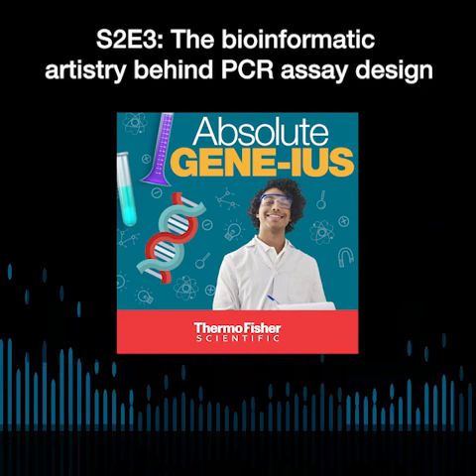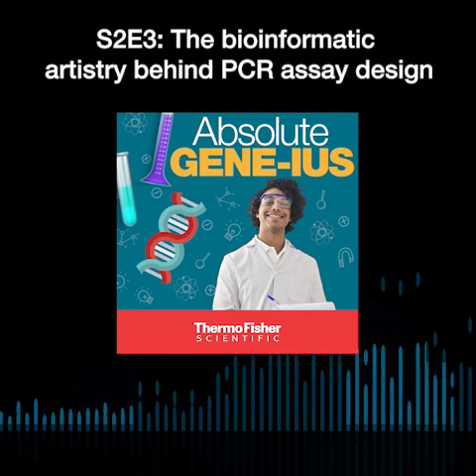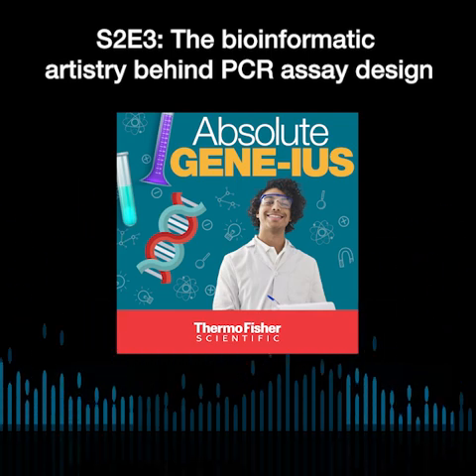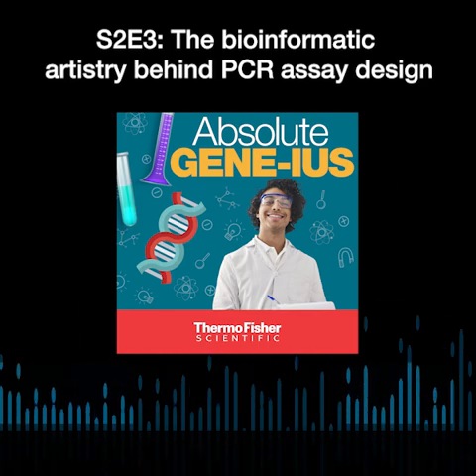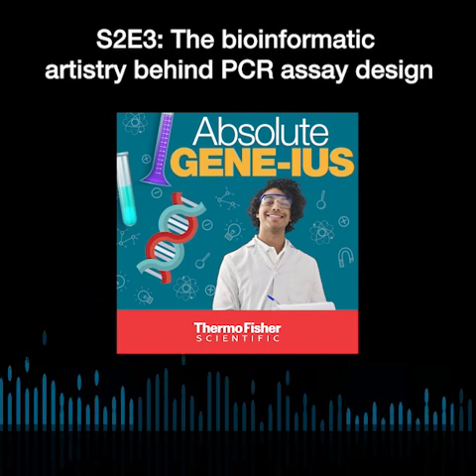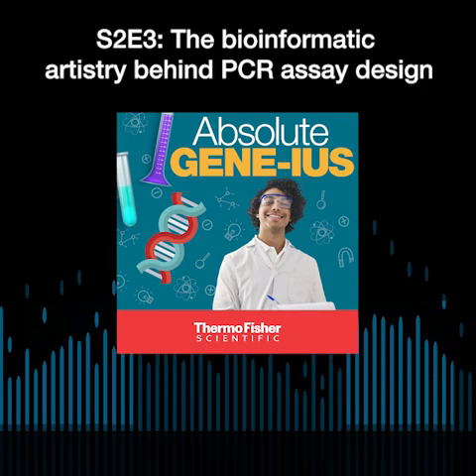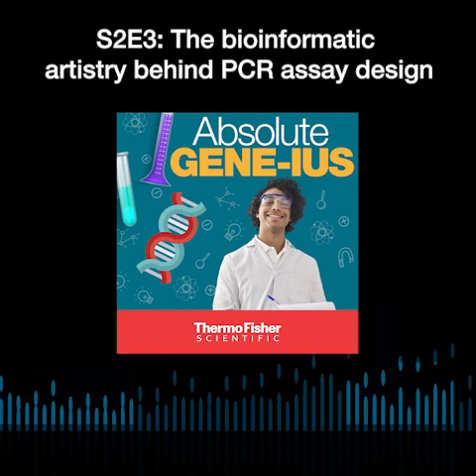I use CYP2D6. I'm actually going to also say CYP2D6. Mine's a slightly more sentimental reason, though. The very first assay I ever designed, that Rounak was teaching me how to design assays, was for CYP2D6. There you go. That's awesome. It goes to the point where I say that whenever I have to use an example sequence, I give CYP2D6. But it was a nice challenge because it had a pseudogene, so it sticks out in my mind.